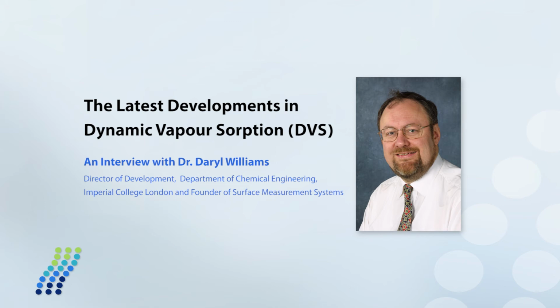Some of the newer developments that we're working on more recently include the use of gas adsorption rather than vapour adsorption, the use of more than one gas or vapour molecule in the study, and also the ability to do multiple samples at the same time, simultaneous experiments. These are all new advances in the area of DVS, and they will show even more opportunity for researchers to use the DVS technique in their everyday research work.